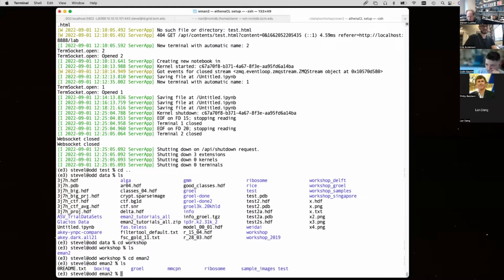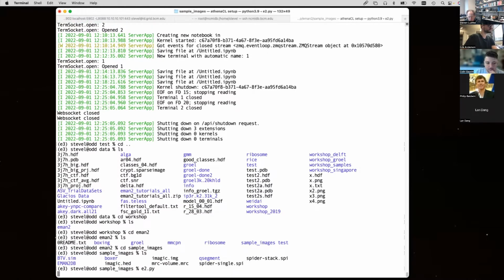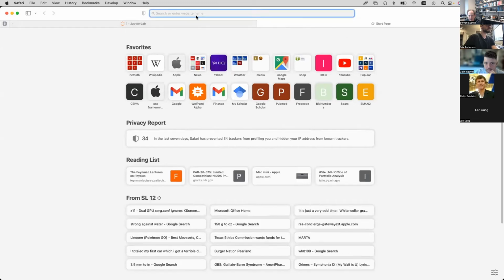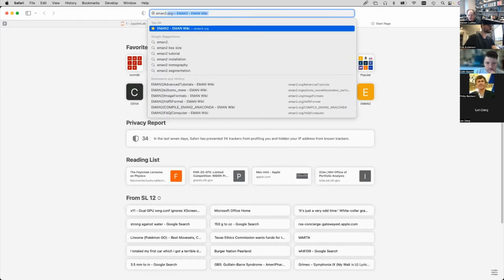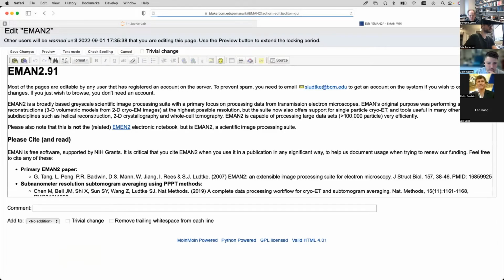Yeah, you probably cannot write to TIFF files still though. That's something on the to-do list. It just hasn't gotten done. And I guess I should update the wiki so it doesn't say that, or it does say that, however you want to look at it. In fact, I'm just going to do it right now so I don't forget.